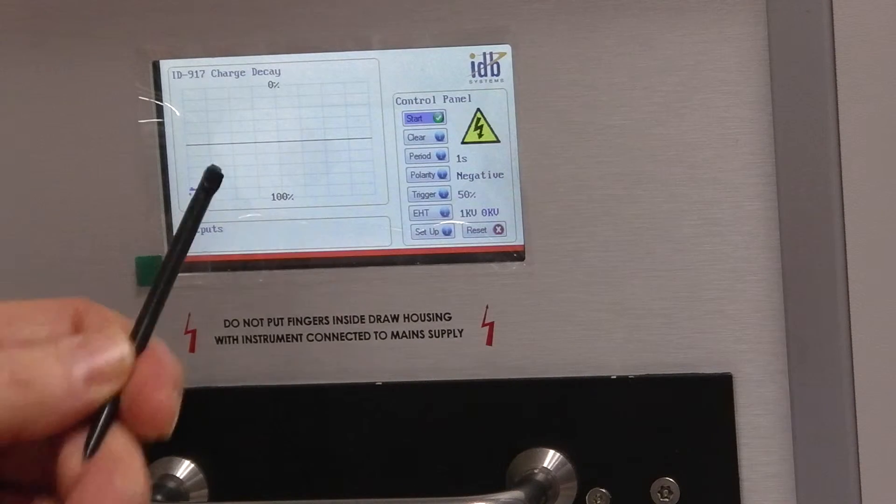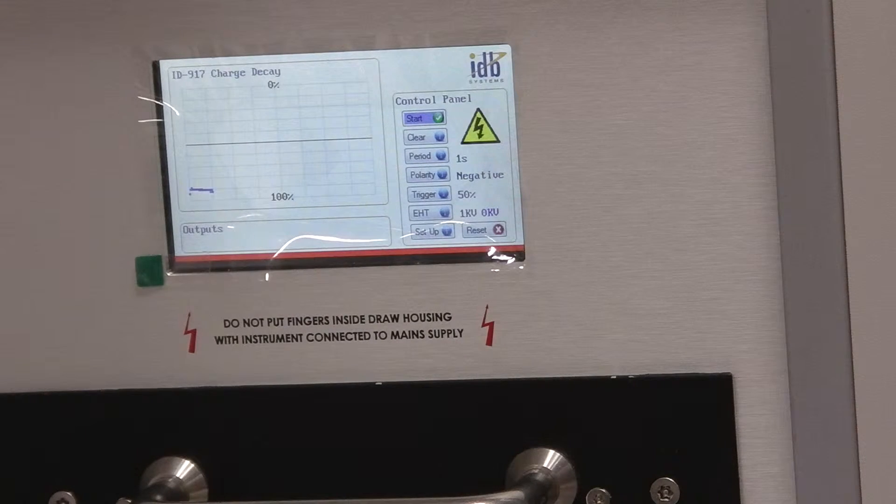And if anything it's actually increasing as time goes on — the pipe is accumulating charge. So this sample has clearly got no anti-static additive in it at all. It's just going from bad to worse, gradually increasing in charge without any other EHT potentially being applied to it. It's attracting charge all the time — it's sorting down.